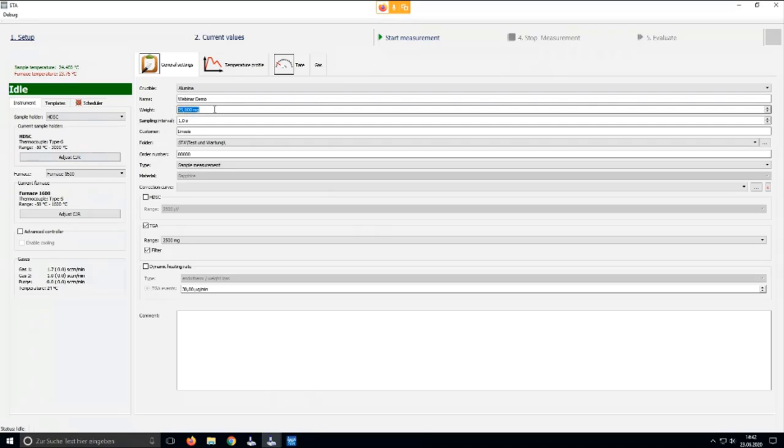You have to weigh the sample on the lab balance and then put it into the system. Our TGA and also our STA are not able to determine the absolute weight. The problem is that the balance always starts at 0 and then monitors or shows you the mass change.